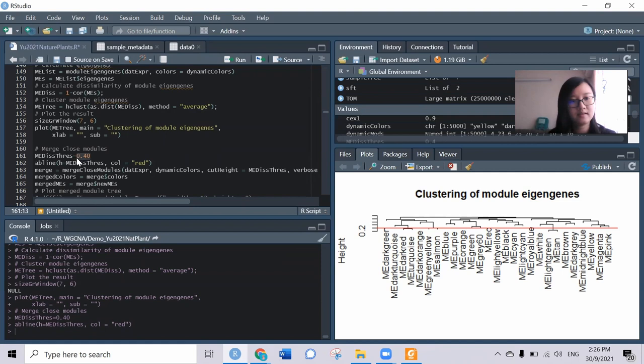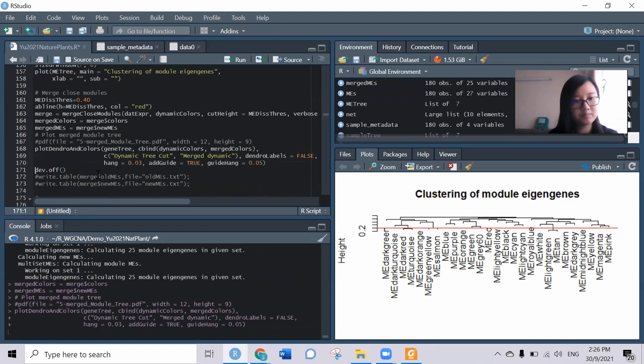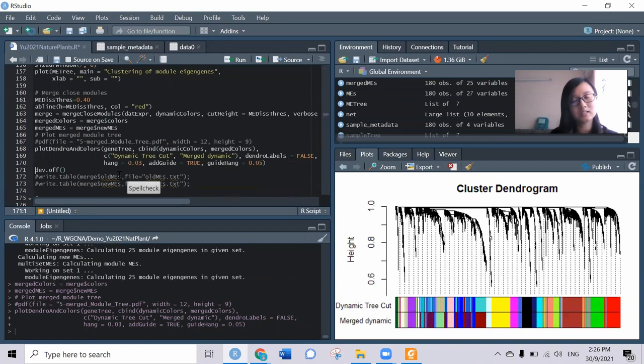Now I merge them together and plot it again. This is how it looks like after merging them together. Not much different, but some of them have been merged into the same module color. This is how we can flexibly do it using the step-by-step method.